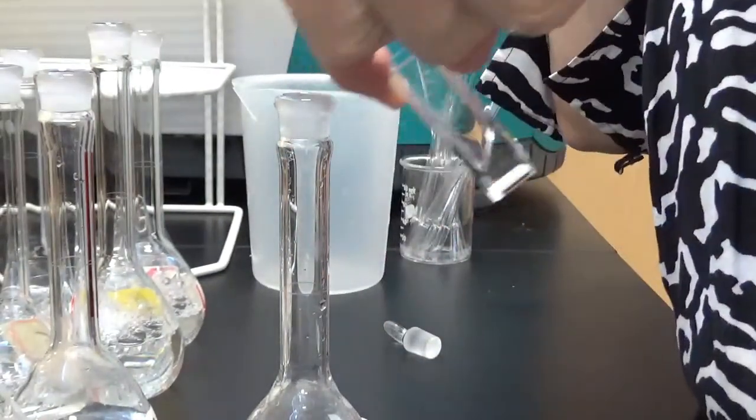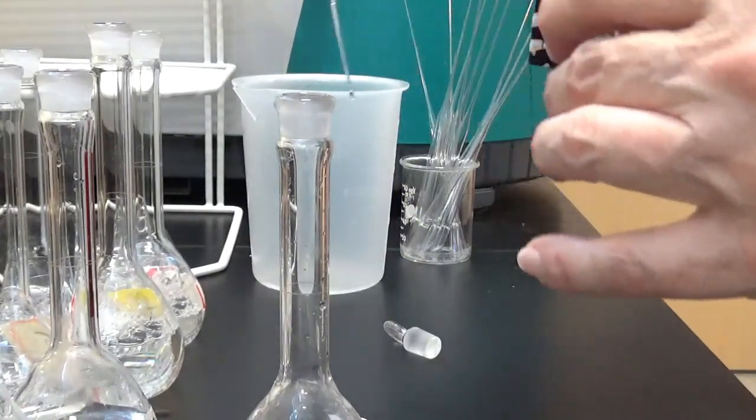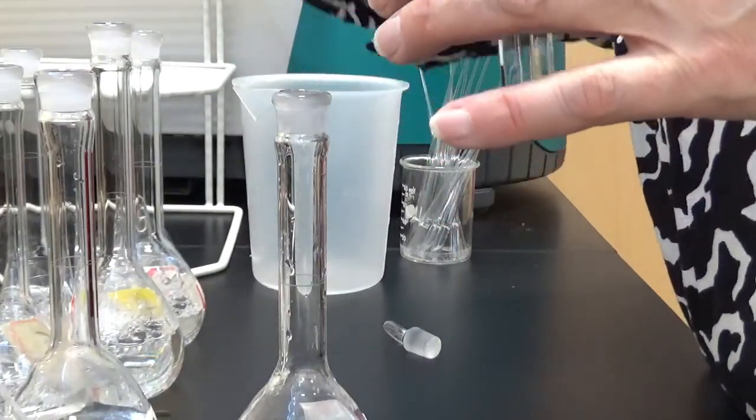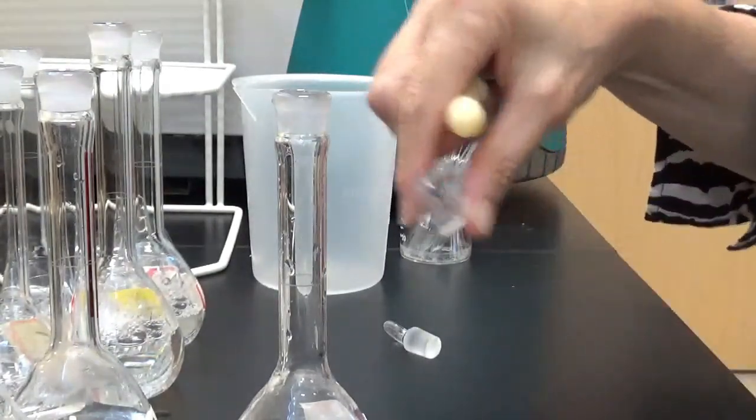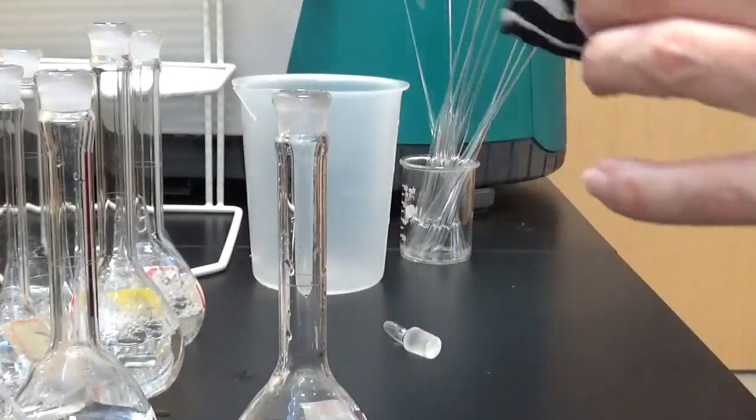Give it a little rinse right in the waste. Maybe do it again. And then fill it up.